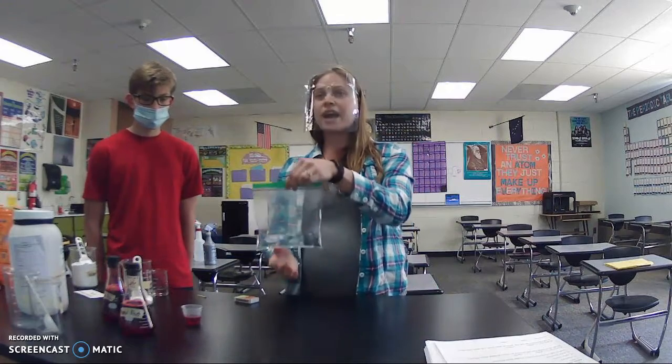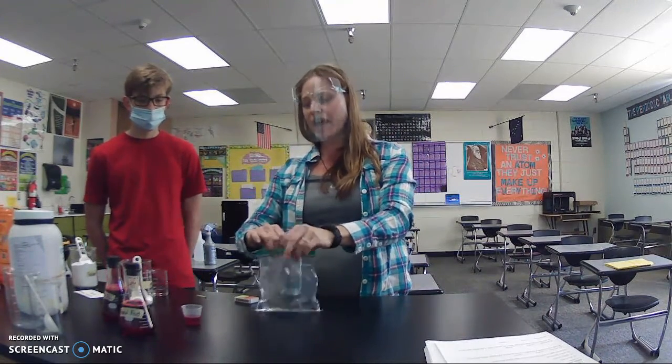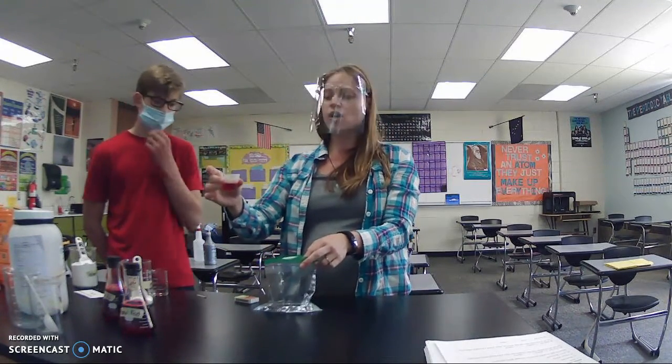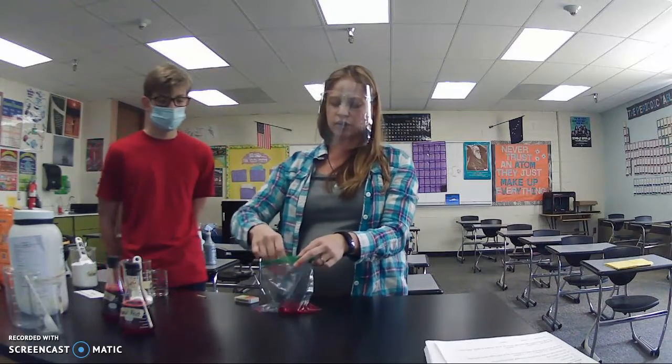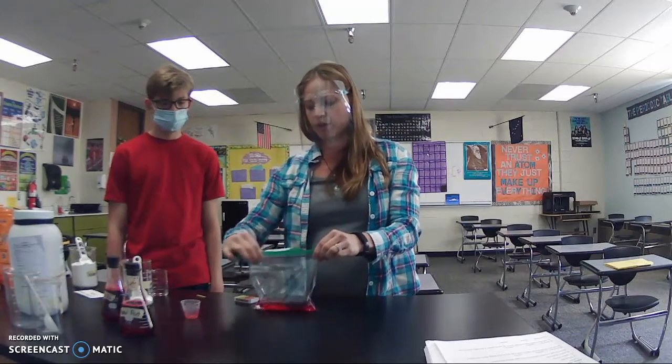All right? So I have the water in the bag. It's a half a cup of water. I'm going to add the phenol red. Phenol red is a pH indicator, which tells us whether it's a base or an acid. Okay? So what we do is we just add that. Close the bag up real quick.